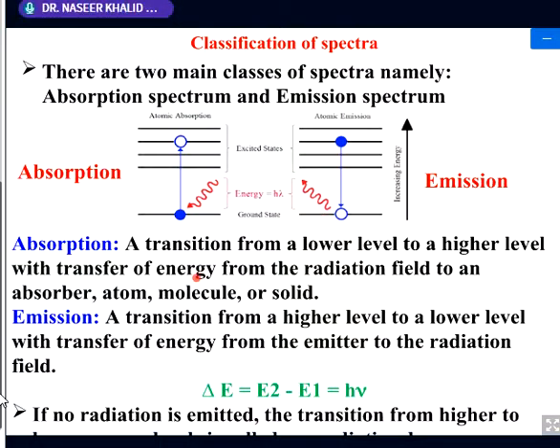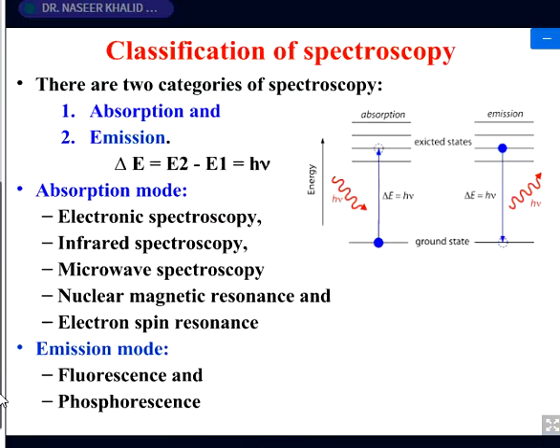For example, there could be a possibility that there is no emission of radiation or absorption of radiation; the excited state, in that case, does not depend upon the radiation. That is just a smaller, lower energy level.